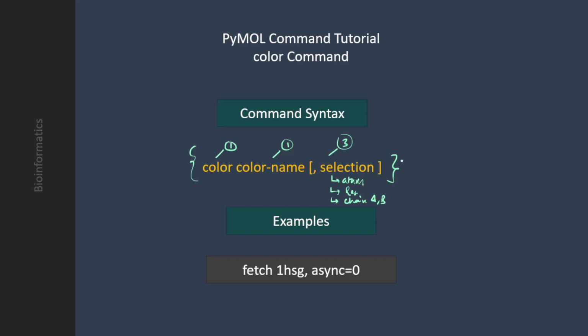It's really important because when it comes to bioinformatics, especially protein bioinformatics, you need to highlight different regions, and you don't want to specifically go to the sequence and manually do that. But it becomes really handy when you know how to use the command. So in this tutorial, I'm going to fetch one protein structure. So this is the command to get the structure. Let me write it down, get the structure.